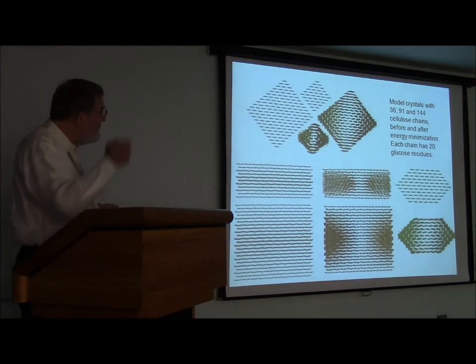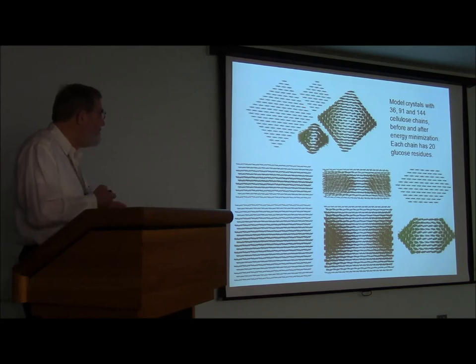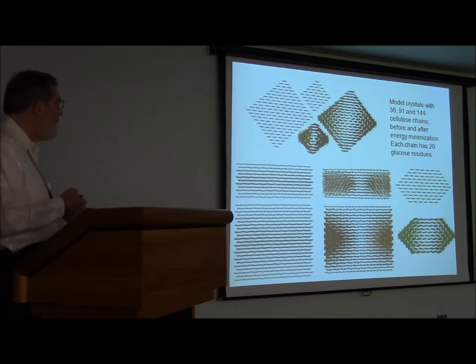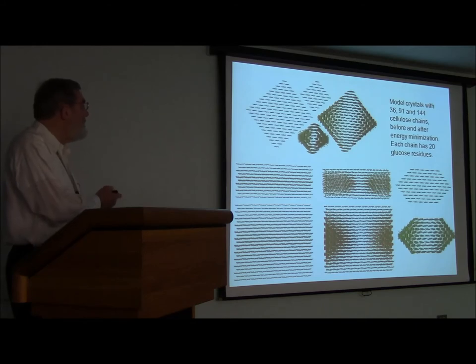So these are just some pictures of different kinds of model crystals. Relatively big one, relatively small one, just like we saw from Nishiyama's work in Biomacromolecules. But we've added molecular dynamics to this so that the atoms are vibrating with the thermal energy, and if we just freeze it, we'll get a model crystal that looks like this. We have other software that can deal with those models as well. I'm not going to talk about that today, but I wanted you to be aware of it.